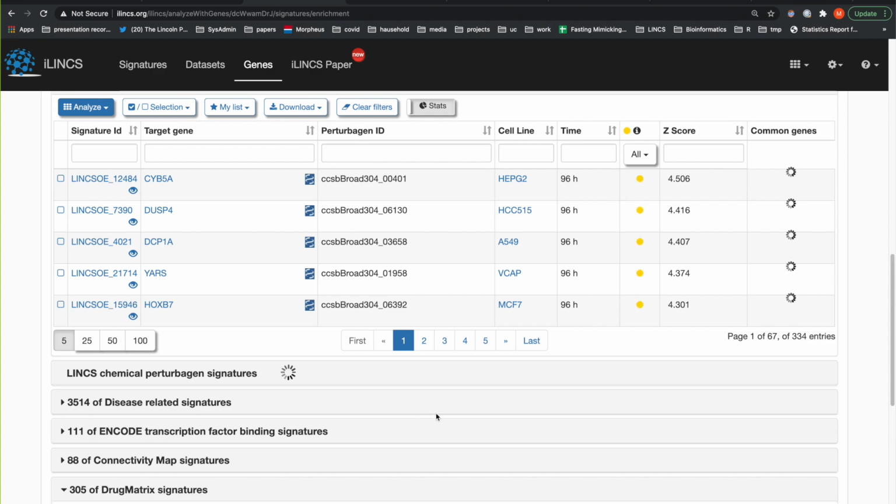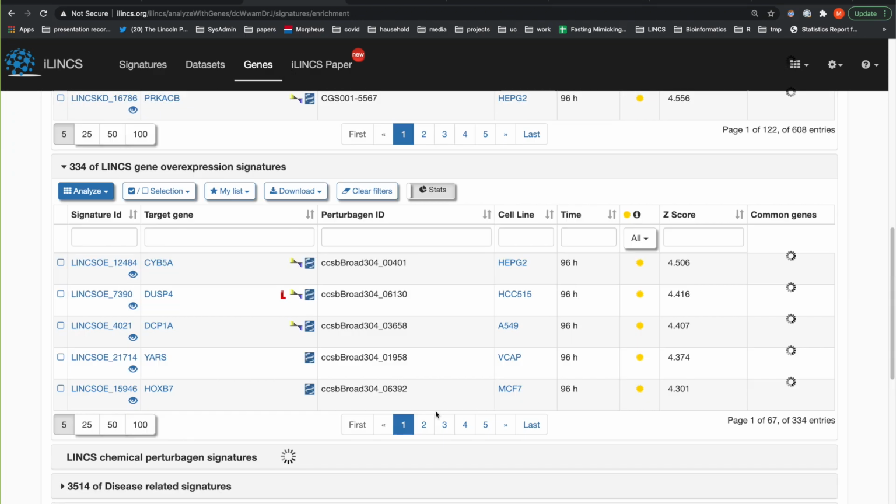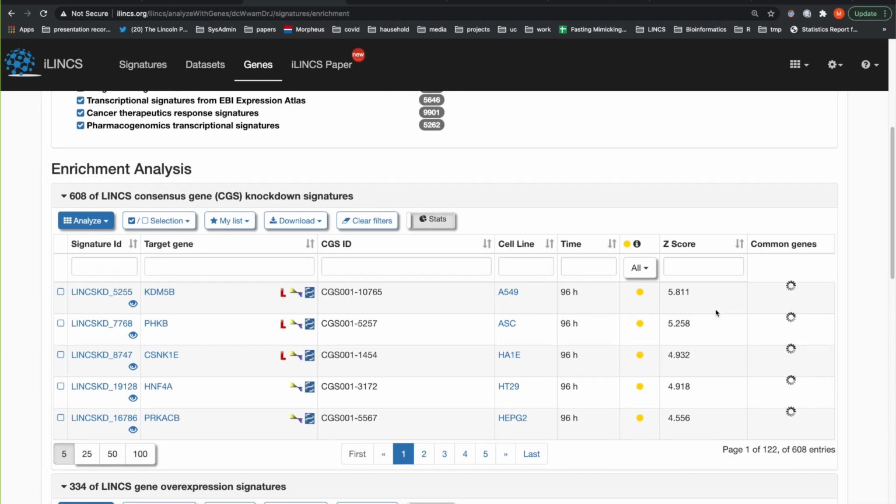Let's see which one's done. None of them are done yet. I wanted to show you, yes.